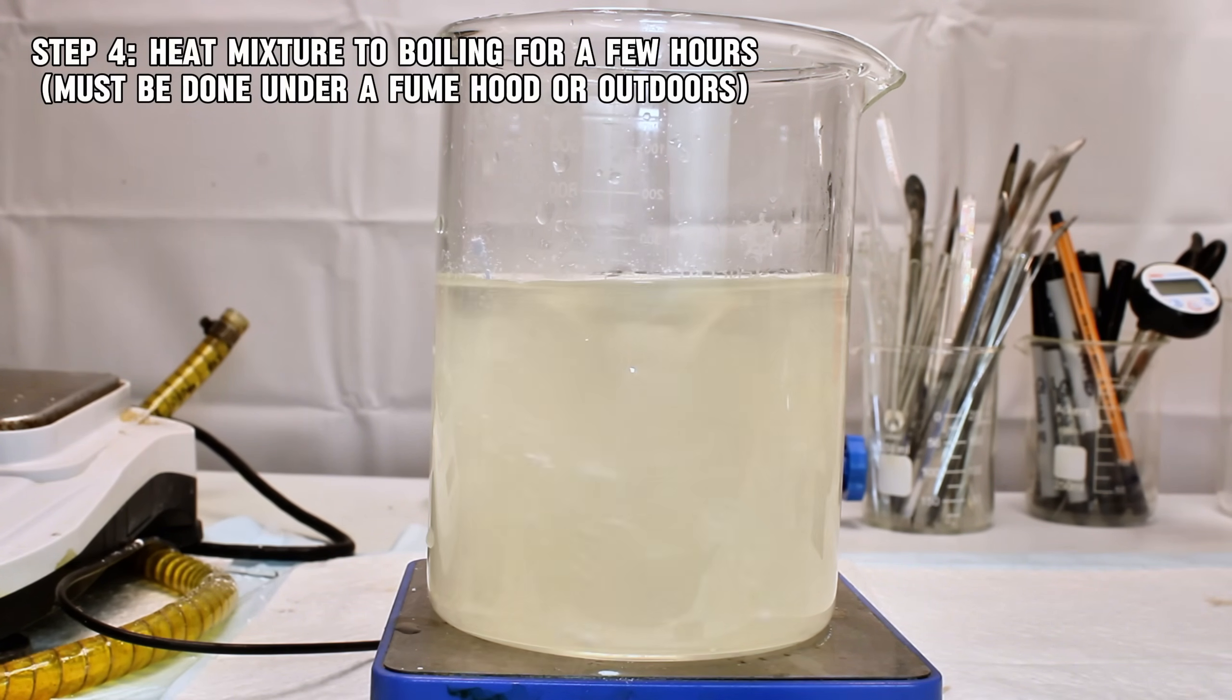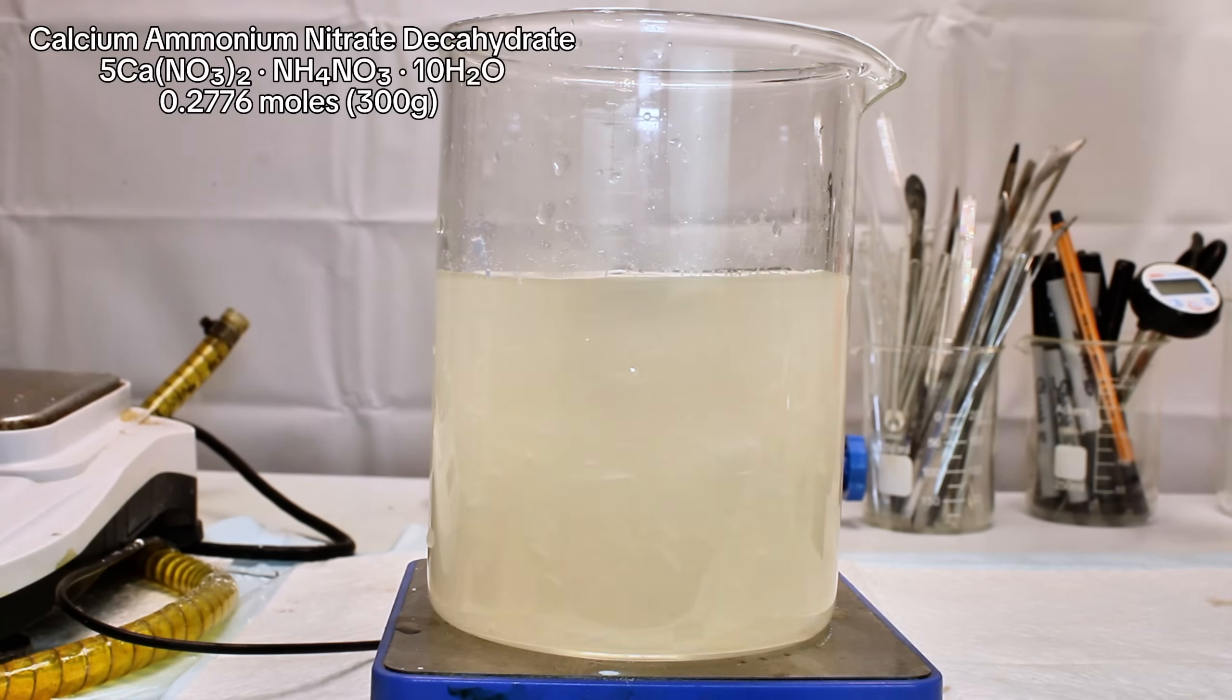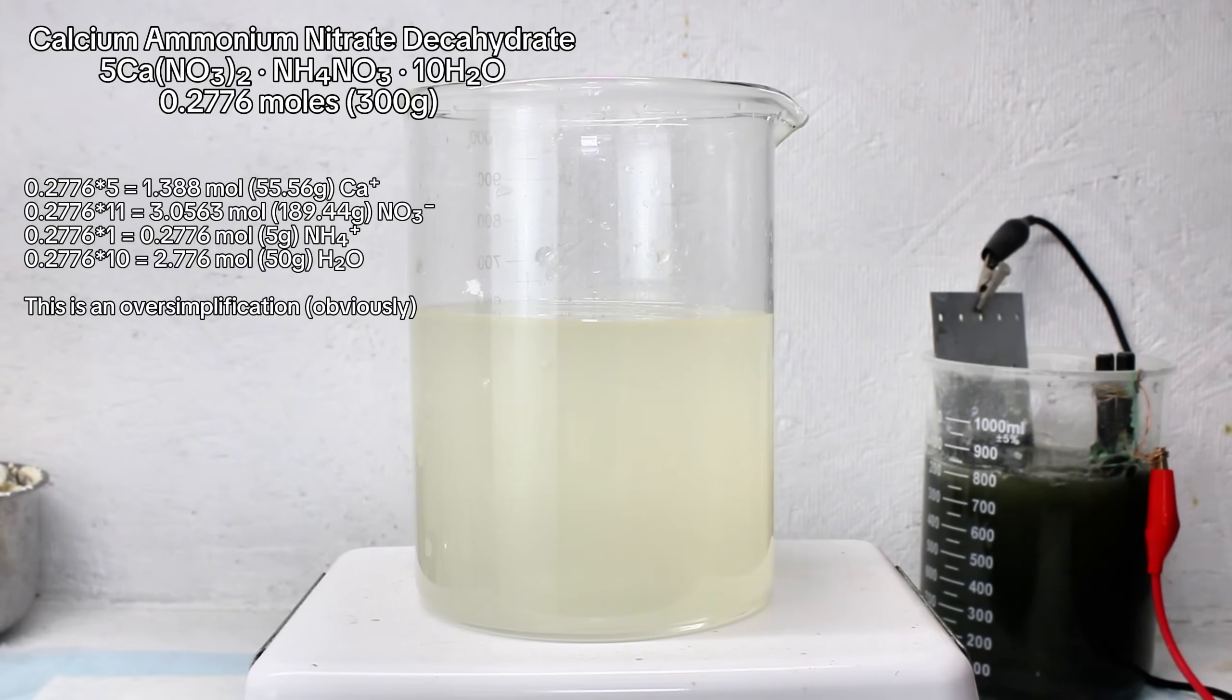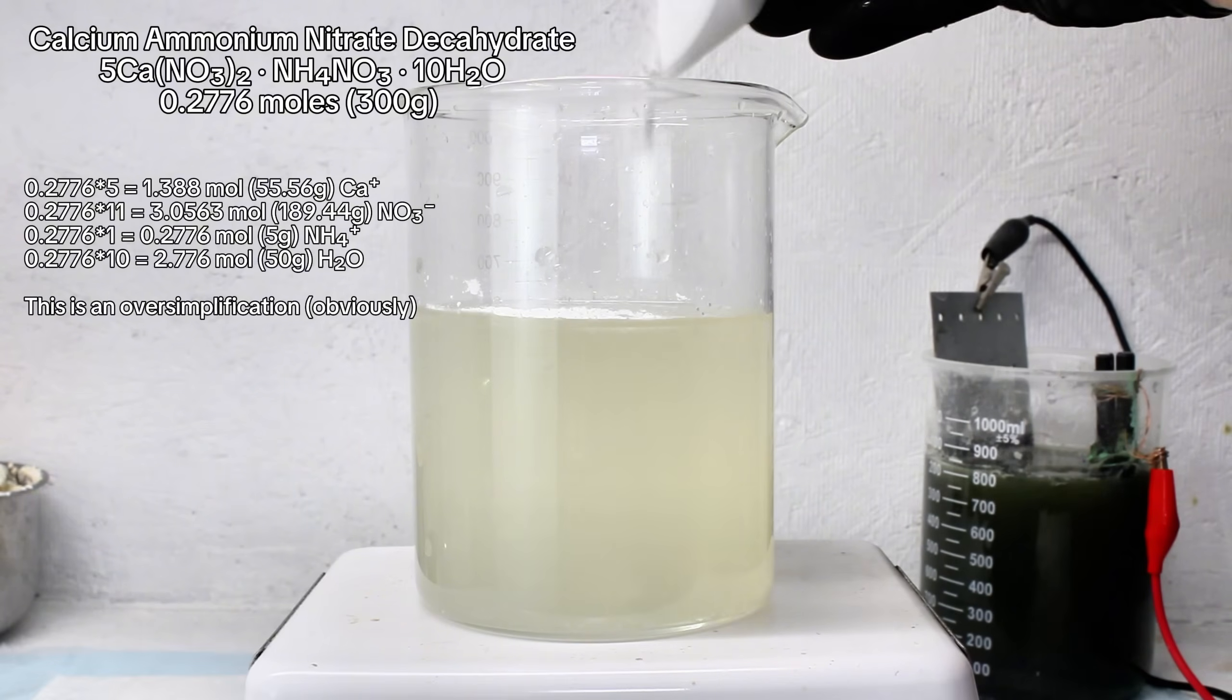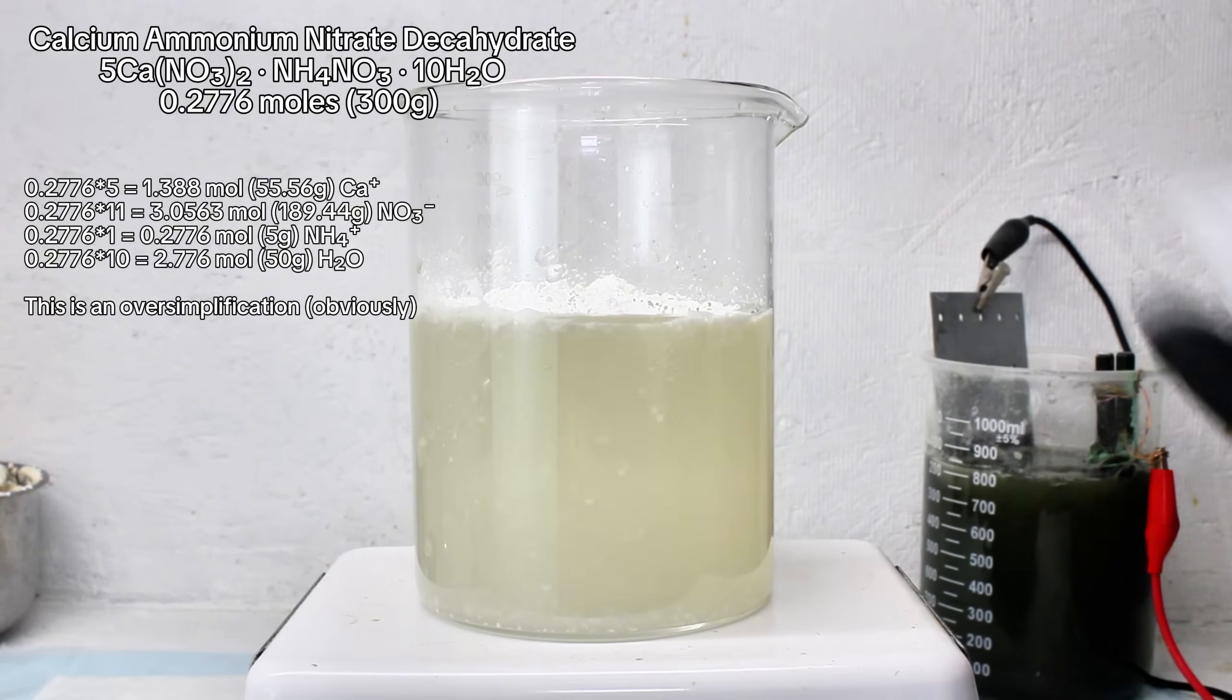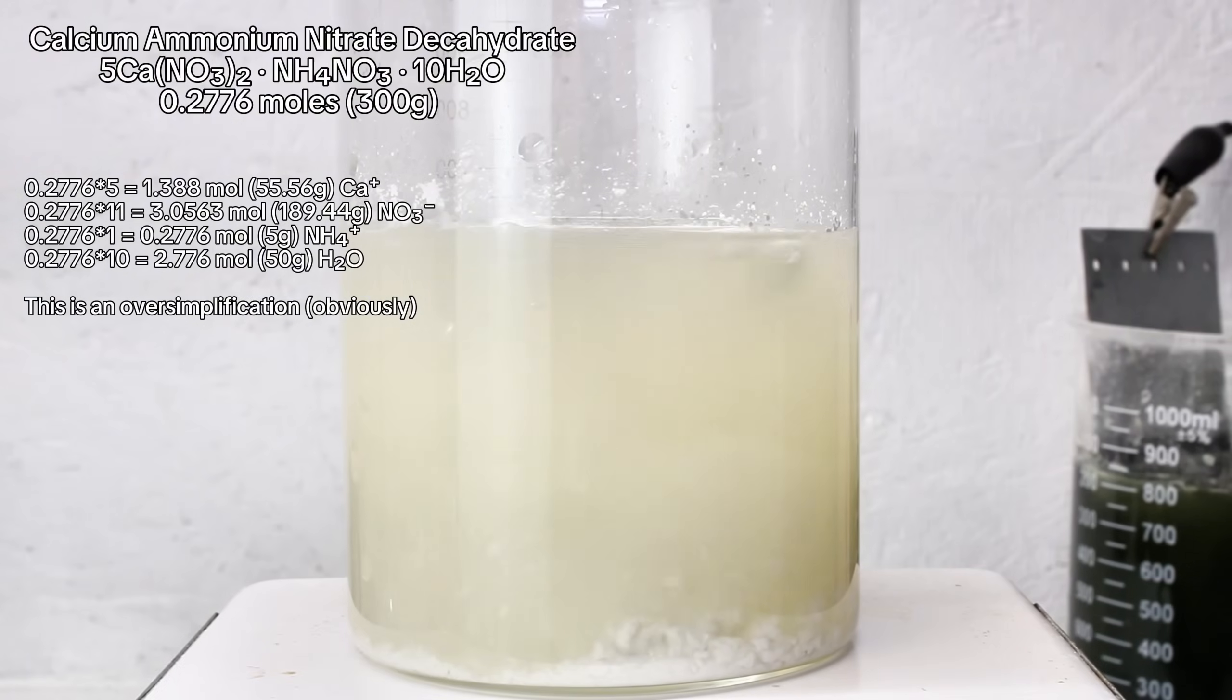What's happening now is that when my 300 grams of calcium ammonium nitrate decahydrate dissolves in water, it forms 55.56 grams of calcium ions, 189.44 grams of nitrate ions, 5 grams of ammonium ions, and 50 grams of water molecules. The ammonium is what we're trying to get rid of here, and the 5 grams represents 0.278 moles, which is equal to the number of moles of CAN I started with.